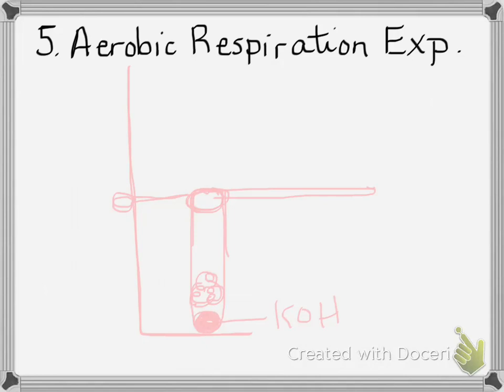Okay, the aerobic cellular respiration experiment. That was my poor attempt to draw it. I already told you guys I didn't take art class. But in case you didn't remember it, I also set some up back here. I'm going to look at them again. They're the ones that look like this. This is the day we had the shaving cream. That's what makes it memorable. Shaving cream.